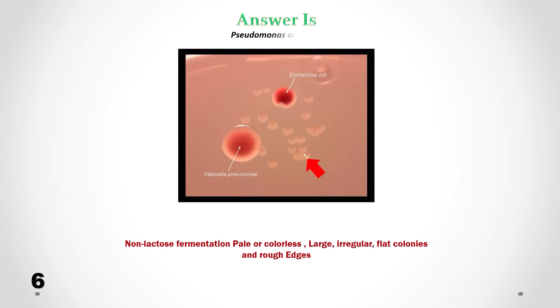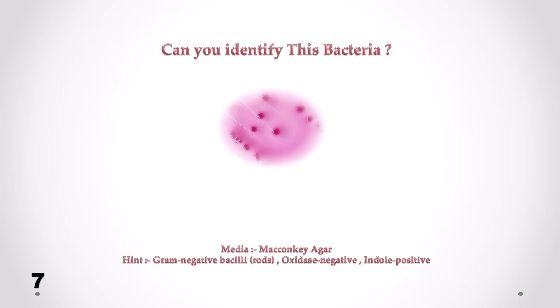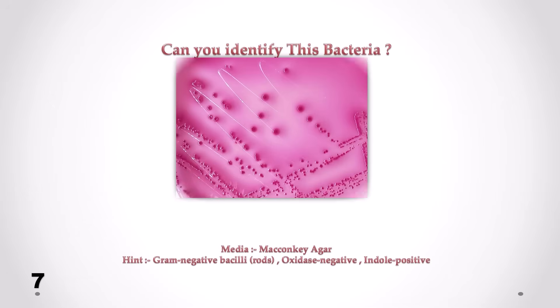Correct answer is Pseudomonas aeruginosa. We can see non-lactose fermentation — pale or colorless large irregular flat colonies with rough edges.